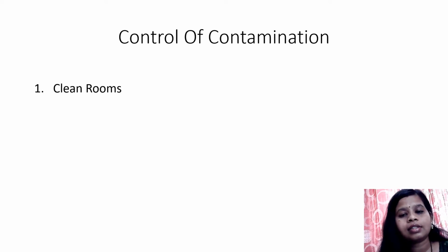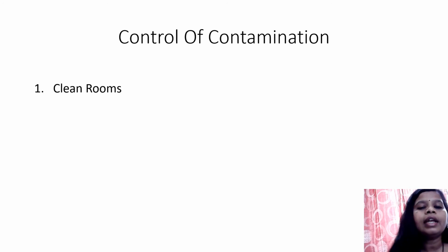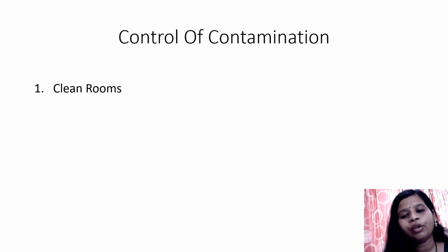Depending upon the operation, these classes are divided, and accordingly the air quality in a particular clean room is maintained.